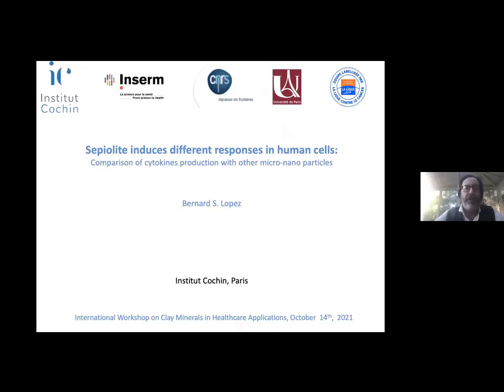In fact, we were interested in sepiolite maybe to be able to transfer DNA into mammalian cells.